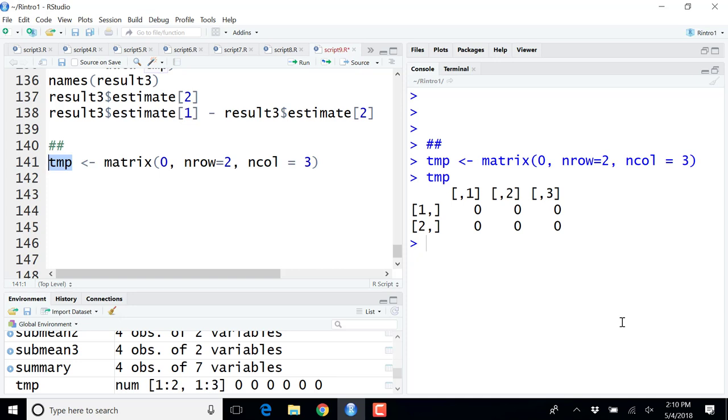This one should be condition 1 versus condition 2. This one should be condition 1 versus condition 4. And here is the fold change. And then here's the t statistics. And then here should be the p-value. I will put this, and if you save this, later we don't need to do the t-test anymore.